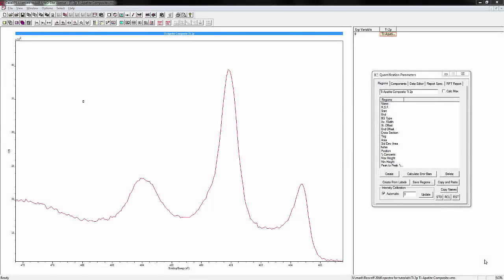We're going to go through the fitting of the titanium 2p peak. This is a sample of titanium apatite composite, and as you can see there's a number of different oxidation states that are present. This is a good example.